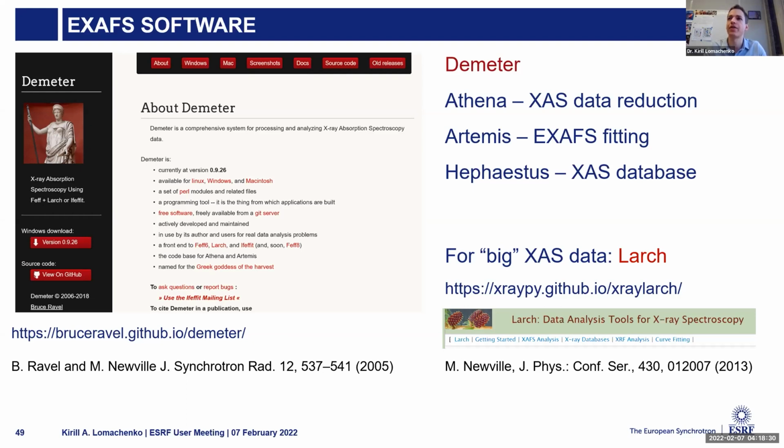It has a graphical user interface, called XAS Viewer, I think, and you can try it just to get an idea of it.